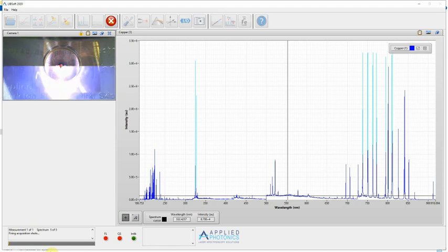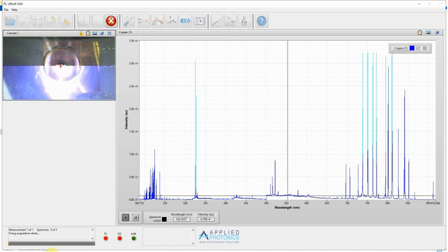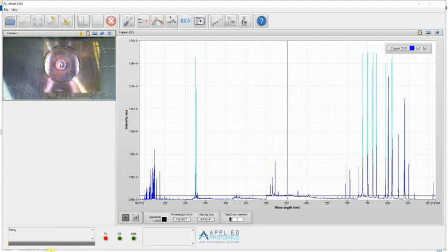And finally the fifth. Spectra are saved and displayed. If we look at the displayed spectrum, we can see that the first of the 5 spectra just acquired is displayed, as denoted by this S1 suffix in the plot legend.